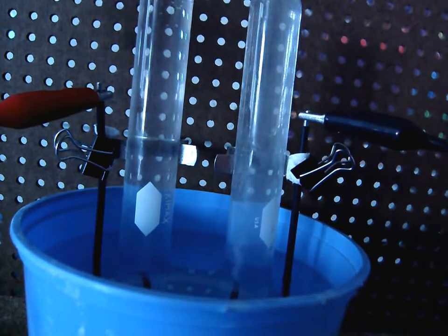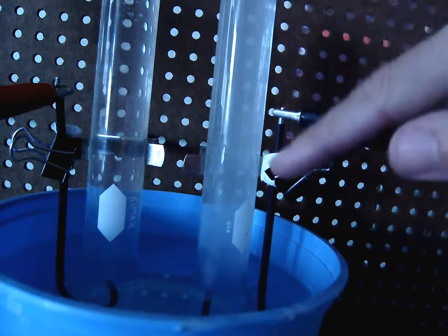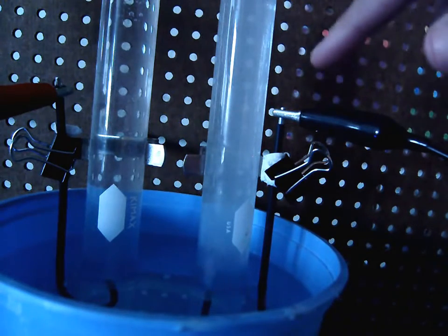So here's what's happening. As the electrical current is being passed through the water, the electrode attached to the black cord is generating a negative charge. So as the hydrogen and oxygen break apart from each other, one of those elements is going to be positively charged and therefore attracted to the negatively charged electrode, which is attached to the black cord. So whichever of the elements is positively charged is going to be attracted to this side right here, because this black cord has a negative charge and opposite charges attract.